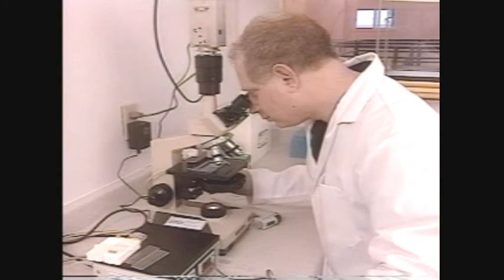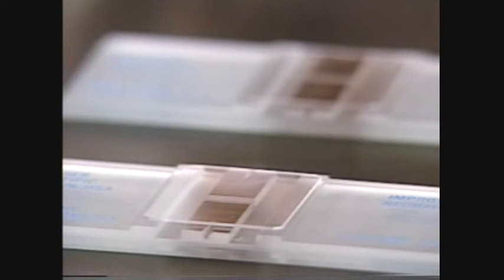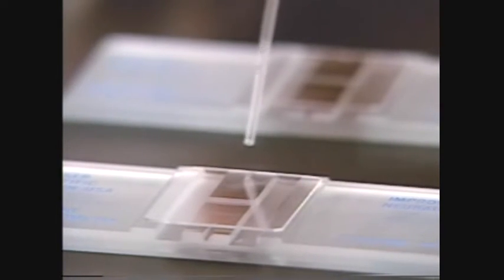The third method for determining sperm concentration is using a special microscope slide called a hemocytometer. This technique uses the slide with its special cover slip in place. The cover slips are made specifically for a hemocytometer and are perfectly flat. Load each side of the counting chamber by placing the end of the pipette in the groove of the chamber and gently squeezing the vial.